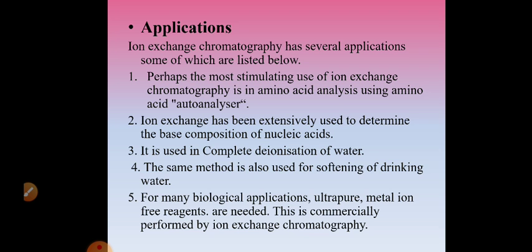Ion exchange chromatography is extensively used to determine the base composition of nucleic acid. Base composition means which of adenine, guanine, cytosine, thymine are present. To elucidate Chargaff's rule, ion exchange chromatography is used. It is used for complete deionization of water. If you want to completely deionize the water, remove all the ions, you can use ion exchange chromatography. It is also used for softening of drinking water, to make hard drinking water soft.